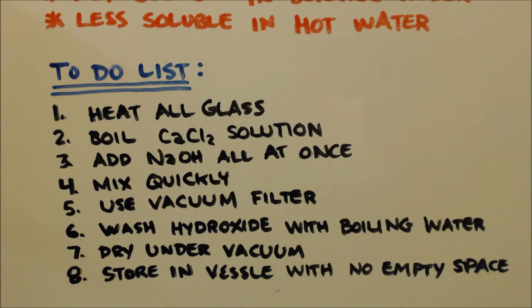You think about it, I made that calcium hydroxide. When I was filtering everything, maybe 15 minutes went by, and then the video was over, and I brought my frit funnel downstairs to put some acid in it to clean it.